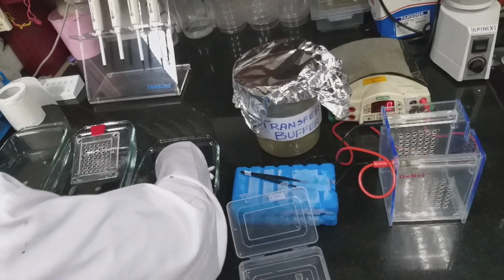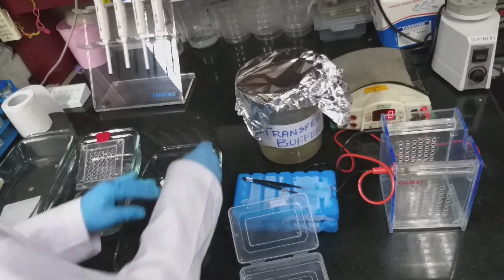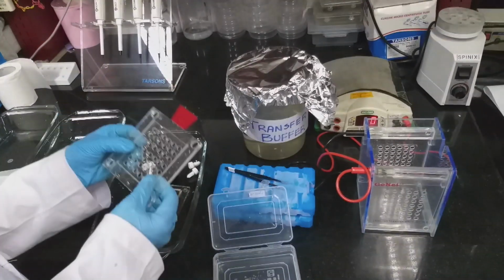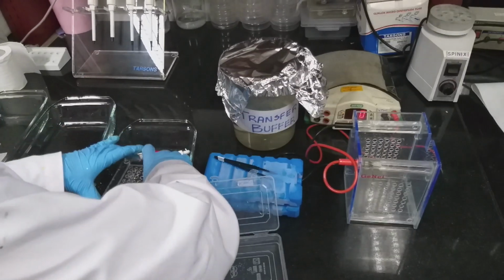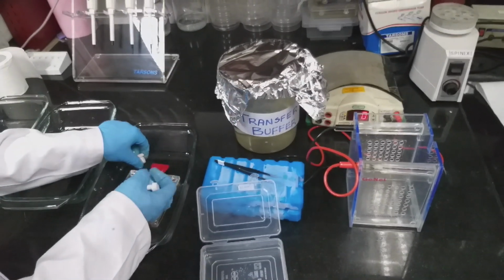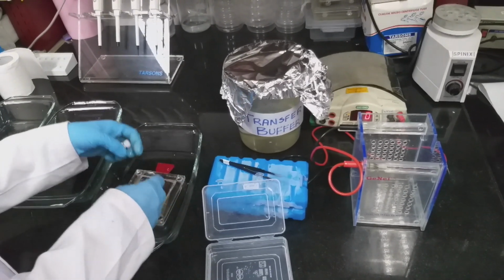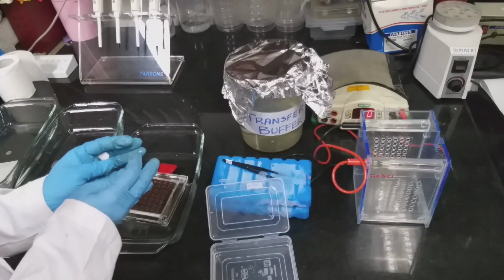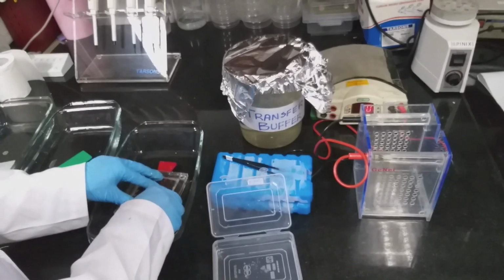So this is the final sheet. This is the positive side of the cassette. Just keep it like this. These are the screws; we have to tighten them up. Then only the contact between the gel and the membrane will be sufficient for transfer.